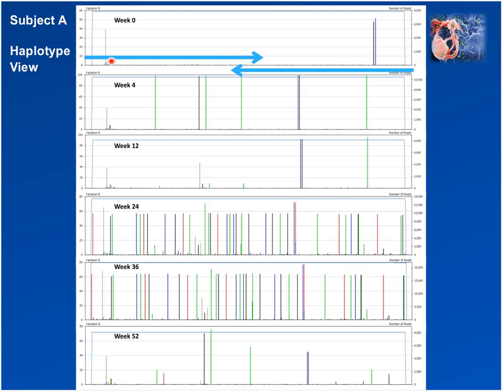And we're going to look further at subject A for a moment. On this slide, I'm going to try to accomplish a couple of things. First is that this is a viral haplotyping example. This is subject A, again looking at all 6 time points from week 0 to week 52 post-seroconversion. And so what you're seeing here are 6 alignment summaries of the data generated from the specimens for subject A.